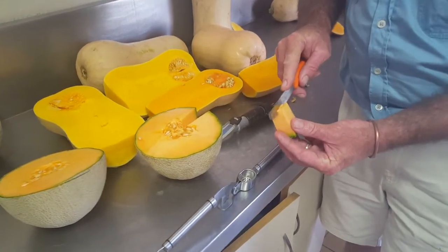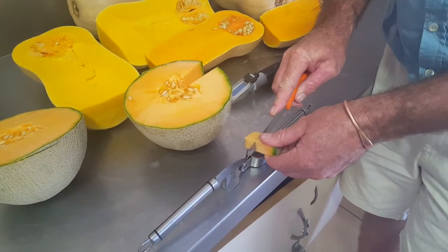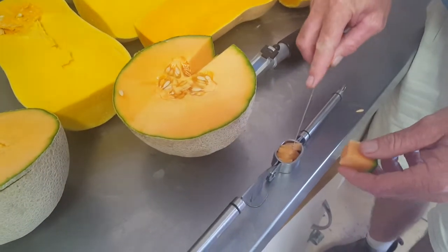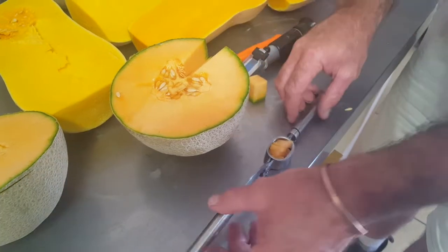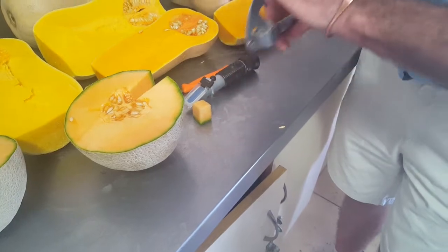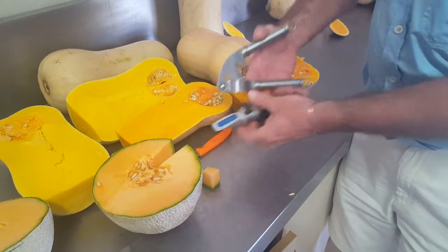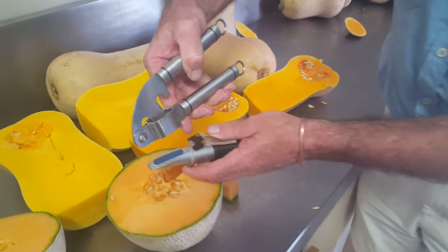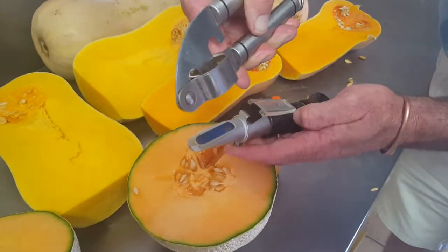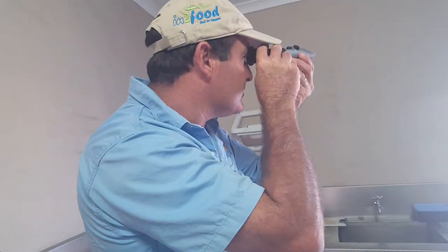We will cut up the flesh of the spanspek and put it into the garlic crusher, then squeeze out the juice onto the refractometer, and basically measure the brix of this fruit.